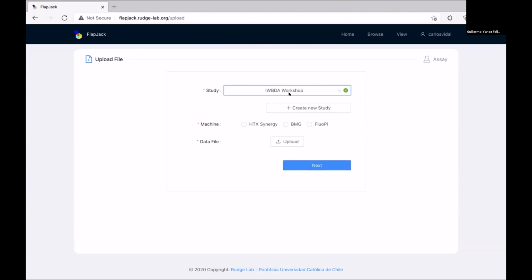Yes. Okay. So the first is Sai. In the long term, do you envision a library of data analysis presets, etc.? So yes, what I understand of your question is that having different types of analysis and kind of plugging them into Flapjack, that's our first idea. We aim for that, and we kind of started doing that using the Python package that Gonzalo has just shown. Because you can pull your data and apply custom analysis, but the idea would be to have, as you say, a library of pluggable modules for Flapjack to perform those analyses.